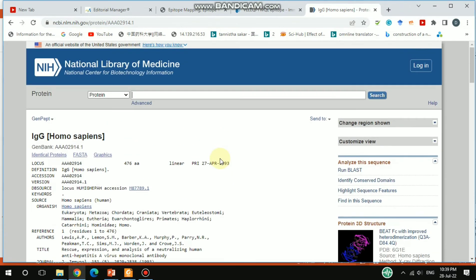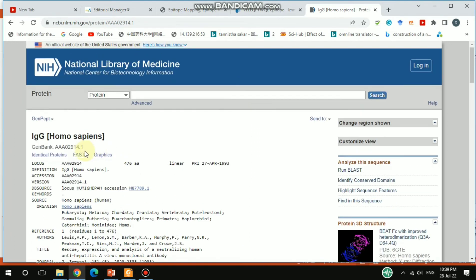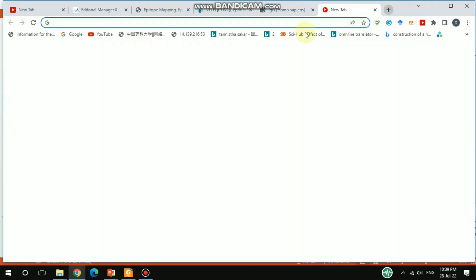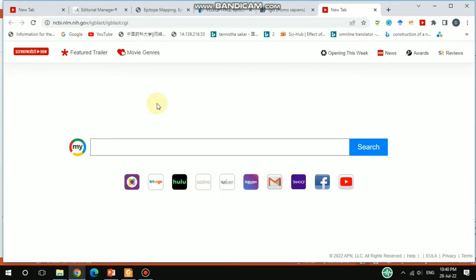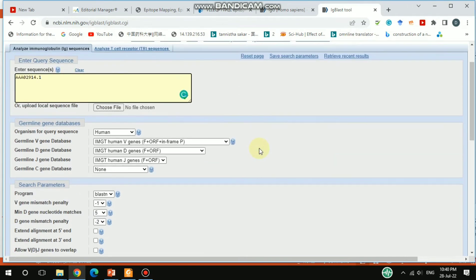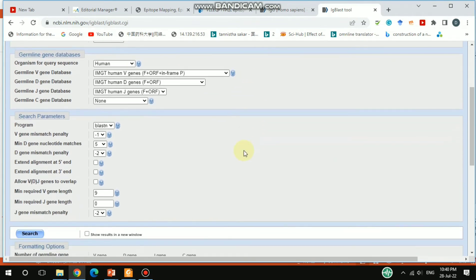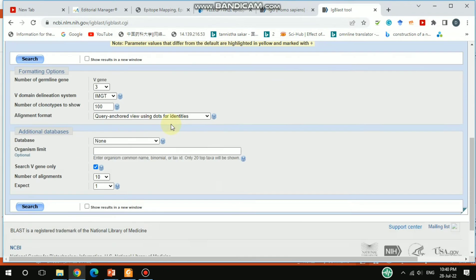For more detailed information exclusively for immunoglobulins, there is the IgBLAST tool. You can copy the sequence or the accession ID from NCBI and go to IgBLAST. Paste the sequence there, select 'protein', and then hit search.